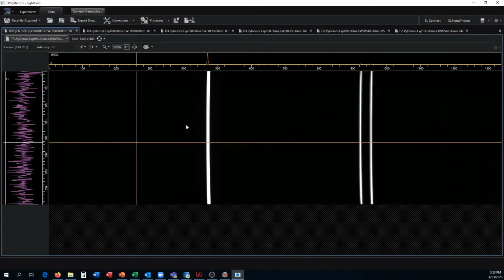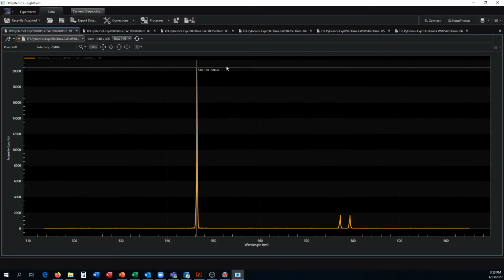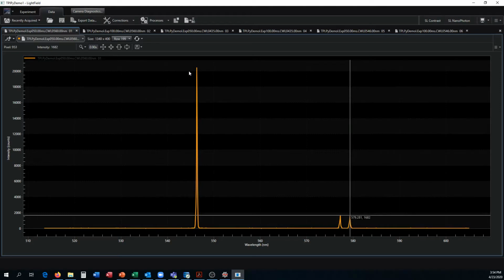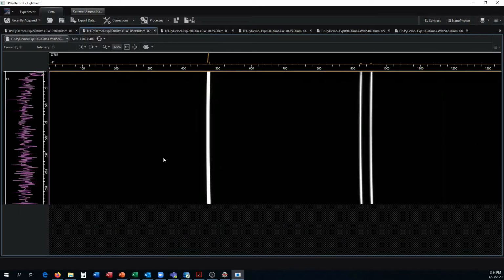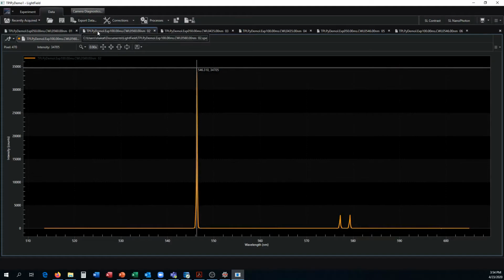Let's walk through these really quickly. Again, we're going to look at the center rows so we can have the wavelength calibration on the axis. You can see the 546 nanometer position, around 20K counts. And here's the 577, 579 doublet that I referred to earlier. The center wavelength, you can see, is 560, so this will be the center pixel position. We'll go to the 546 peak right here. I picked the highest value. Let's look through the graph. You can see the exposure increased and the intensity counts went up as well.